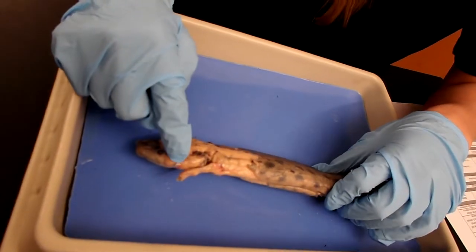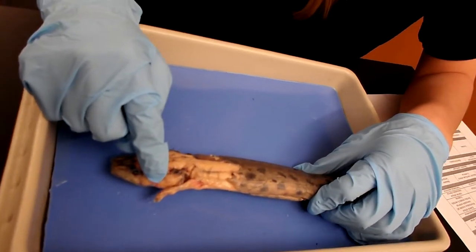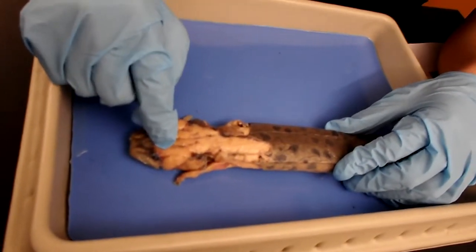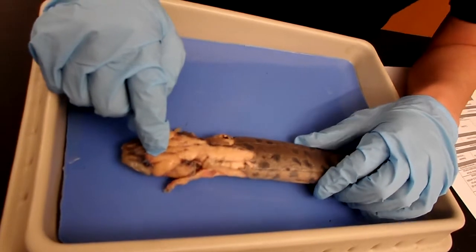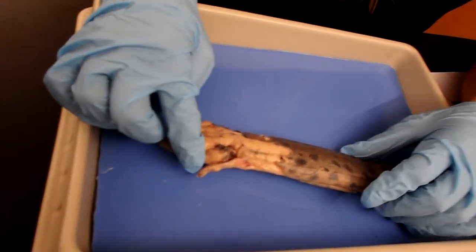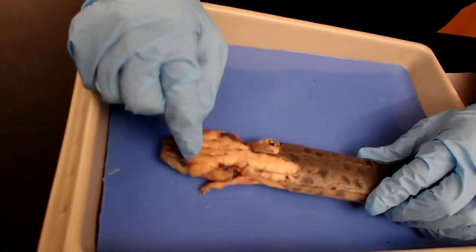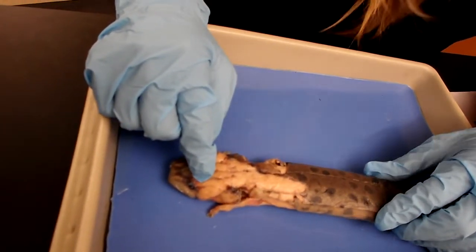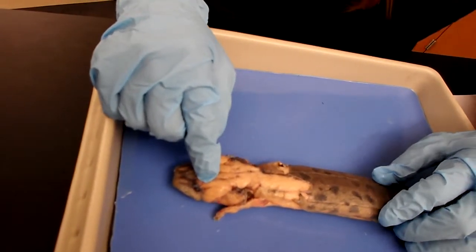Right here is the levator mandibulae externus, and right here is the levator mandibulae anterior, and together they make the adductor mandibulae. The levator mandibulae externus originates at the parietal and inserts at the dentary, while the levator mandibulae anterior originates at the parietal and the frontal and inserts at the dentary.